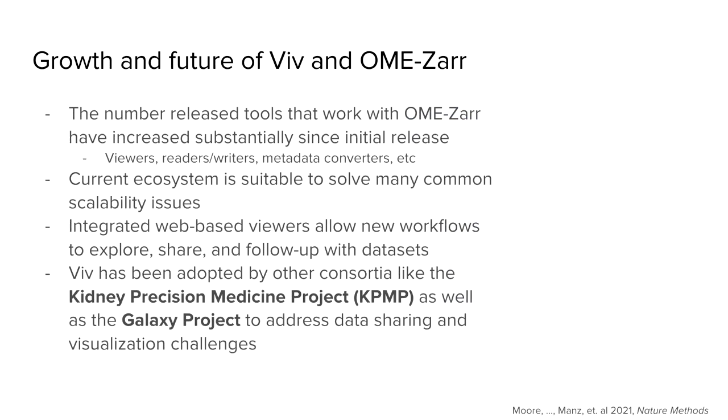And the Viv tool has been adopted by other consortia outside of HuBMAP, including the Kidney Precision Medicine Project, as well as the Galaxy Project.